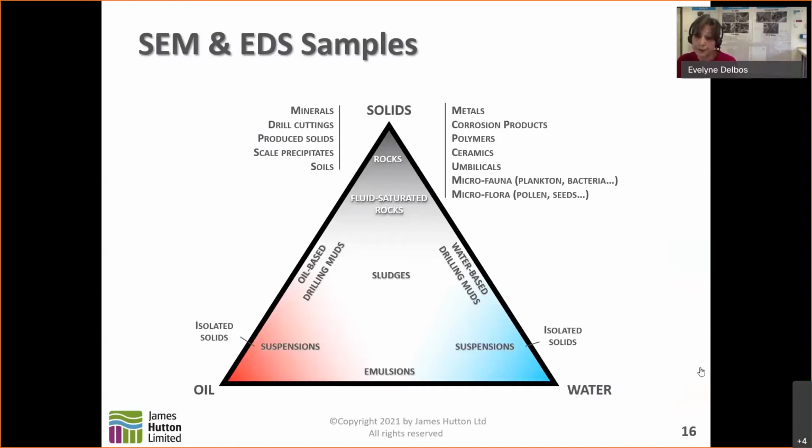from the liquid samples with the emulsions, any suspensions that would be within these emulsions, and sludges, and more importantly, the fluid saturated rocks can be looked at as well in the frozen state.